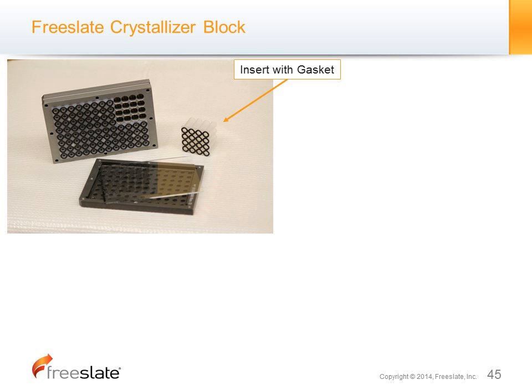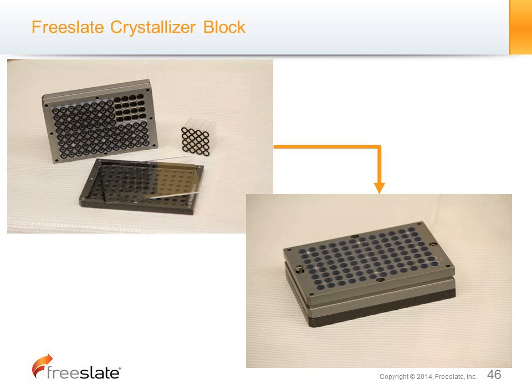And then you have these inserts with tubes, where the steel balls and the compound will be deposited, and you have a gasket at the end when you put it together. You put it together here. After you close everything with the glass plate at the bottom, the gasket separates each well from the others, so that you build pretty much a 96 well plate.